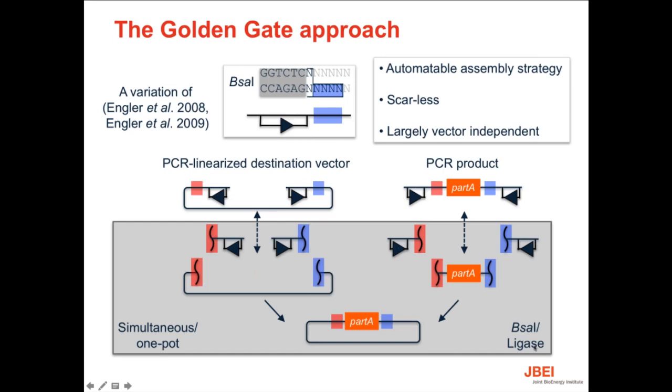And then you have a ligation step where you can basically take the cut parts and ligate them together. Now, not only is it possible to go to your final product, but you can also reversibly ligate back to get to your original starting material. However, for the final product, there aren't any BSA1 sites left in the final construct anymore, so you can't digest this. So this is effectively a dead end product. So over time, after several thermocycles, your population of molecules will evolve towards this desired end product.